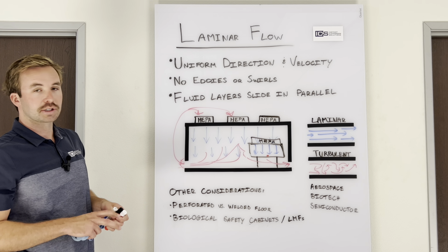Okay? And the thing that's great about this is as we clean this tube right here, it's going to be flowing laminar flow air, ISO 5 air, all the way out. And to the point where when we took a particle count at the end of this tube, because this whole tube was cleaned, it was also ISO 5. Horizontal or vertical laminar flow would not have provided the same purpose.